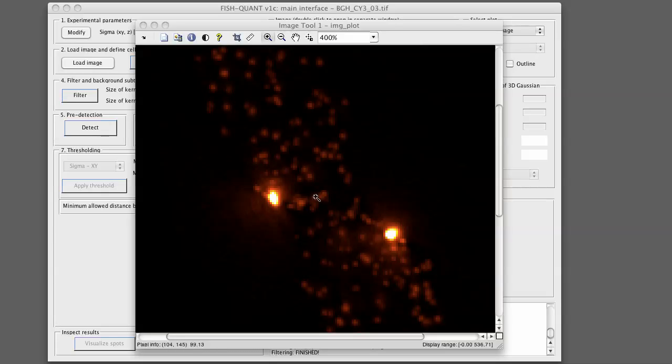So you see this pixel here has an intensity of 100, 70, here around 60. So this gives us already an idea about the intensity range of our spots in the filtered image.